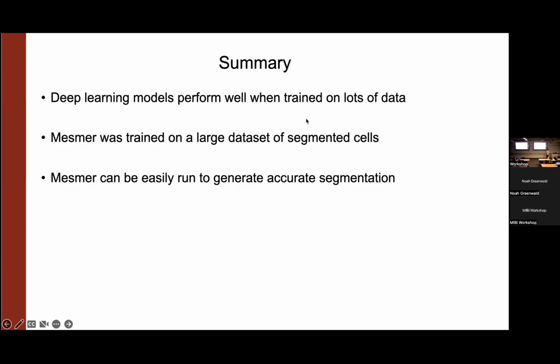So I went on a long sabbatical to try and find a nuclear membrane marker that was robust, and ended up not doing that. So yeah, that sucked. One of the things that I remember we found was that a lot of the more conventional nuclear envelope stains, like Lamin C, we actually found pretty significant variation based on cell type.